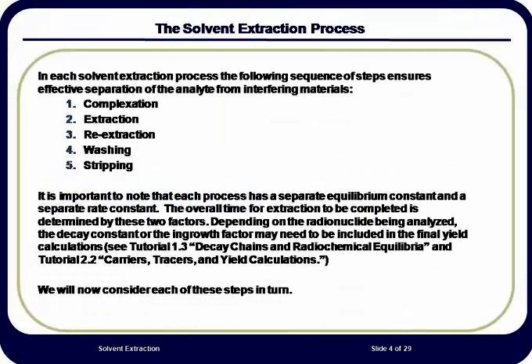Step 3 involves a process known as re-extraction. The original aqueous phase is extracted with a fresh aliquant of the organic phase of the same volume as the first. This improves the efficiency of extraction of the radionuclide of interest. After step 2 is repeated, the 2 organic phases are combined. The aqueous phases are discarded at this point unless they are needed for analysis of radionuclides not extracted.